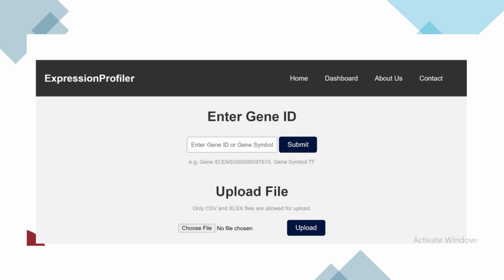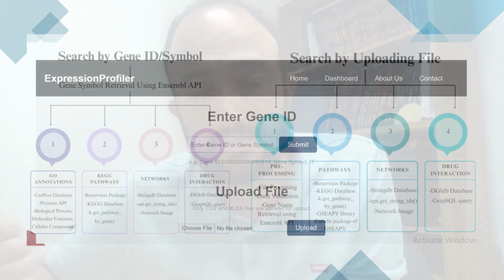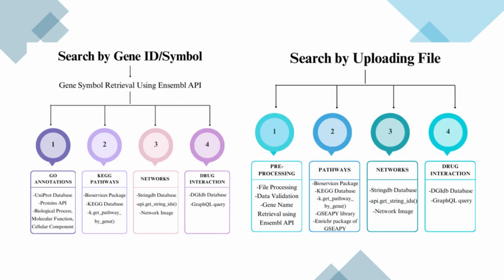That is, if we have transcriptomic data, be it from RNA sequencing data, microarray data, or qPCR data, we can input that transcriptomic expression information into our tool, and it will pre-process the file and annotate it by the gene names. For now, it is only for humans, but it's very easy to make it for other species as well. If you need it in other species, we can build it for you.